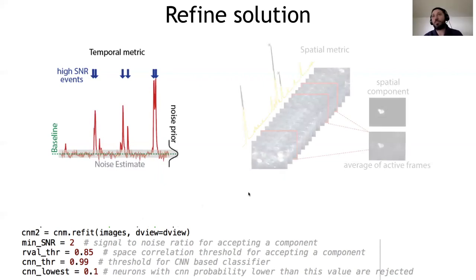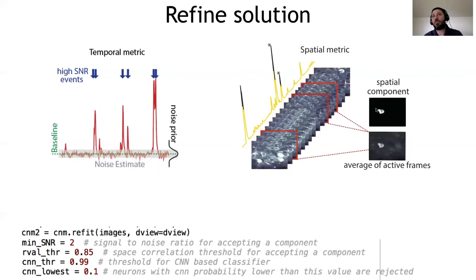We are checking how similar is a spatial component extracted from the algorithm to the neuron that is in the field of view. To achieve this, we only average the frames in the movie during which the neuron is active. If we do this properly, we should have something dark all over the place, except where the neuron is. And then we can cut a little corner here and then compute the correlation between these two. If the correlation is high, then it means that most likely we got a neuron. Instead, if this is noise, the correlation by definition would be zero. And the threshold on the correlation between minus one and one is this one 0.85.